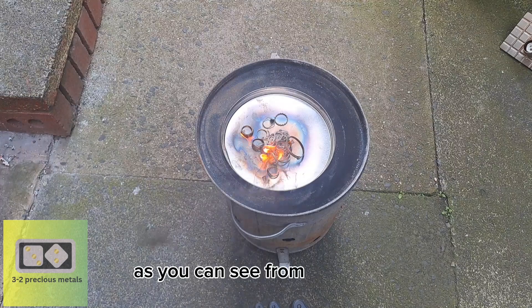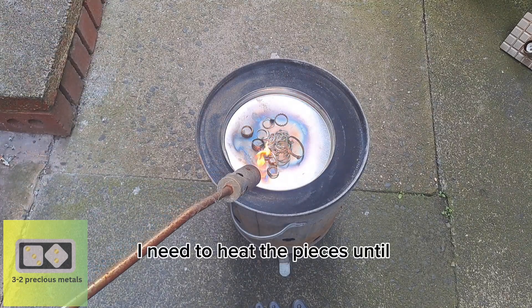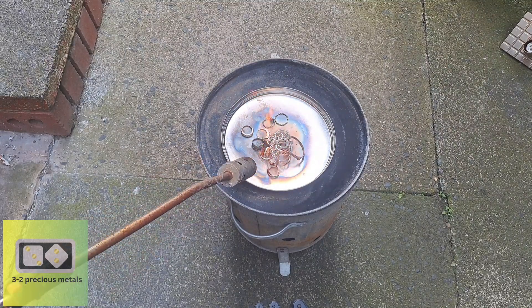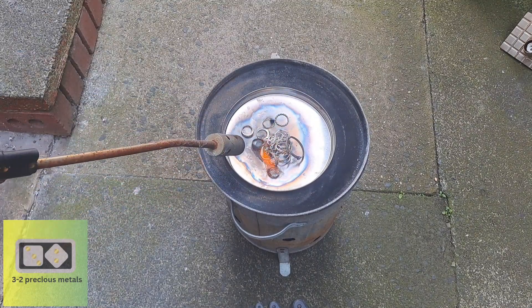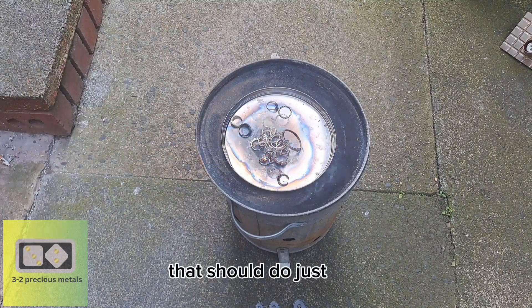As you can see from the flames, not everything there was silver. I need to heat the pieces until no more smoke appears from them. This took a few minutes, so I'll speed it up a little. That should do just fine.